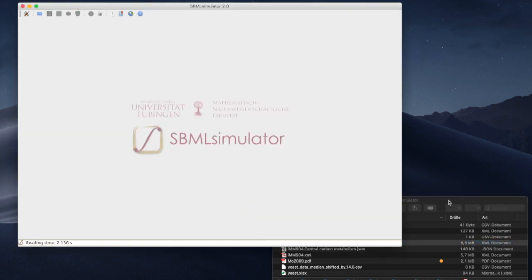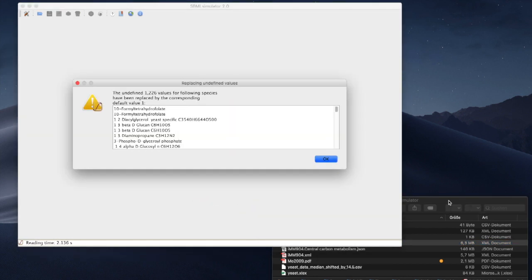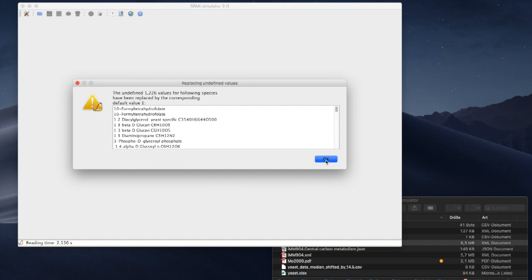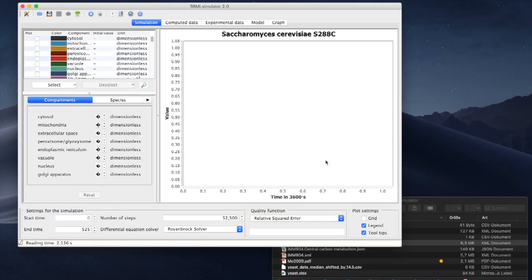We now see a warning that many model components lack initial values. This only matters when running a dynamic simulation. Since we plan to use SBML simulator to create an animation of experimental data, we don't need to run a simulation and can safely ignore this warning.